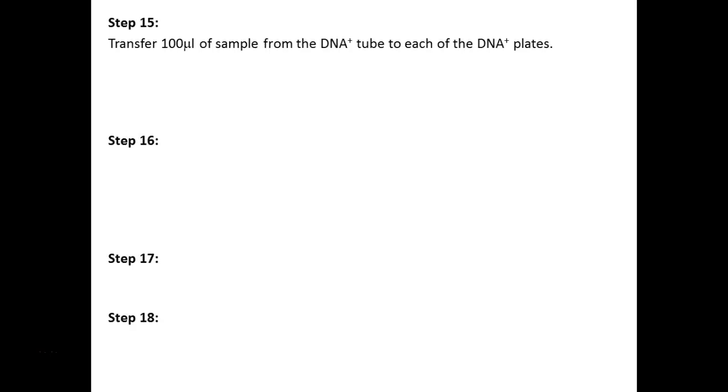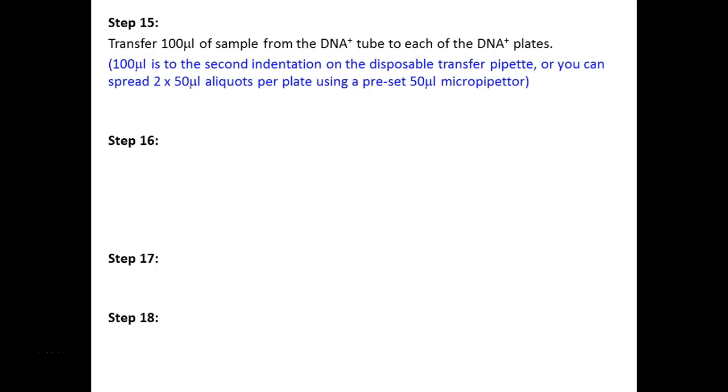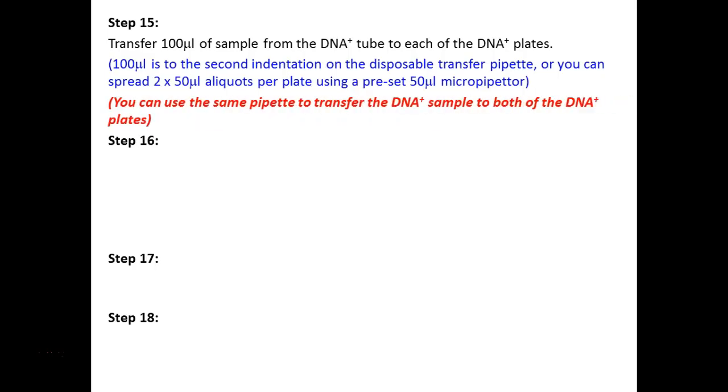So then, when we transfer to our plates, oh, you guys didn't take the little blue pipetters. That's okay. We'll get them for you. The little blue pipetters are like micropipetters, but they're fixed volume ones. So you don't have to worry about changing the knob. They do 50 microliters every time. But we want to plate 100 microliters on our plate. So what are we going to do? We're going to do it twice, right? You're going to squirt onto the plate twice, right? 50 plus 50 is 100. Again, you could use those other pipettes, but doing that really small volume is even harder.